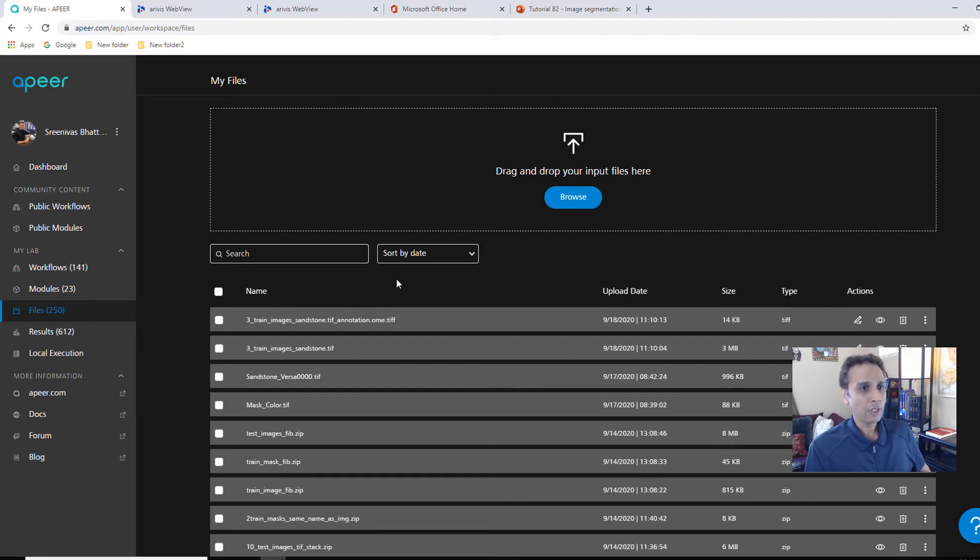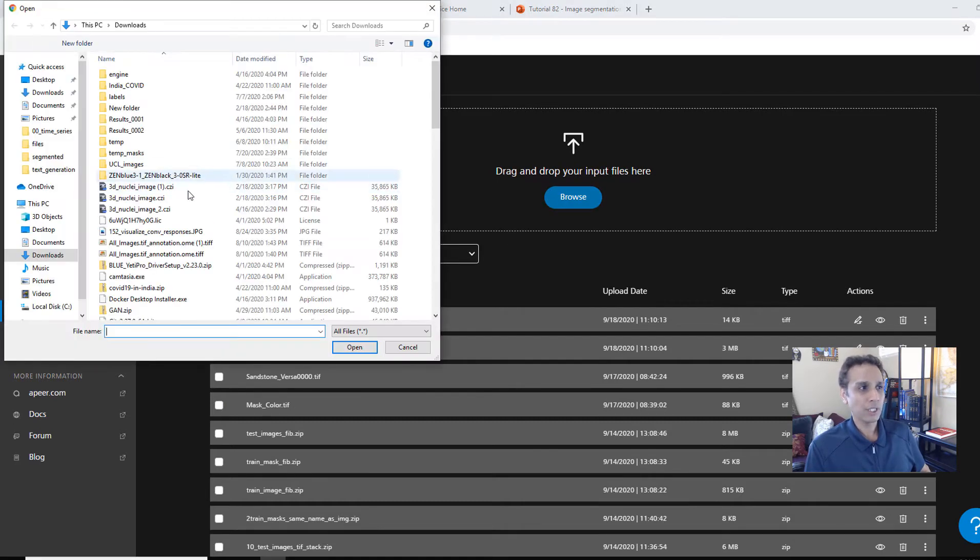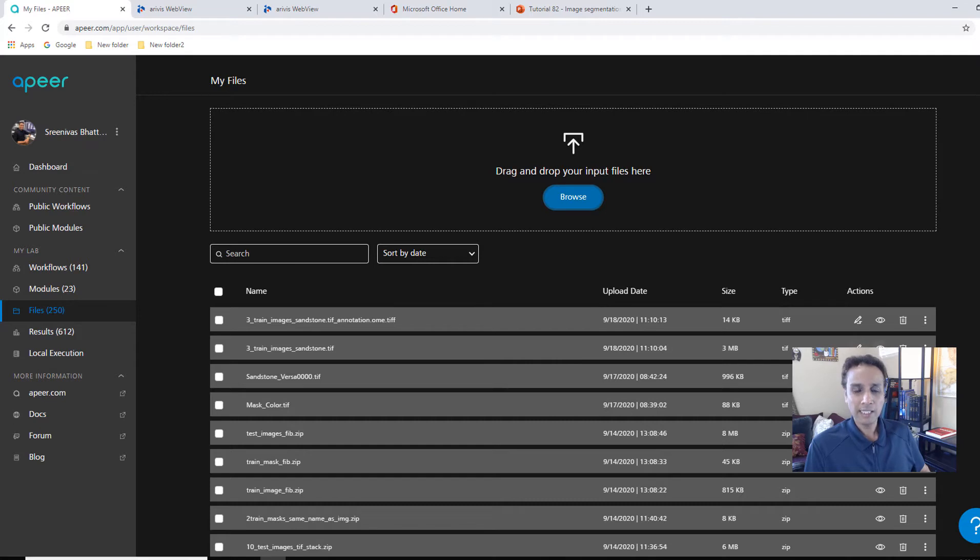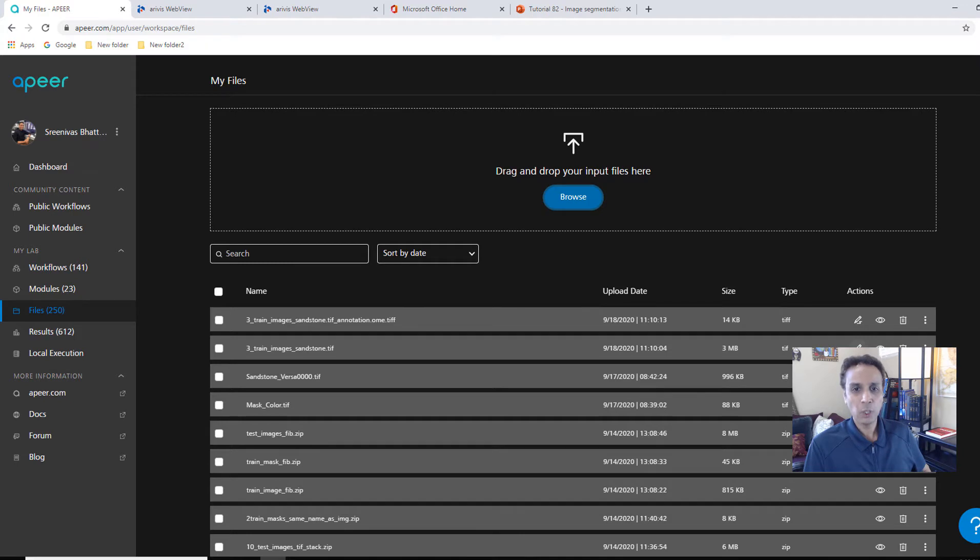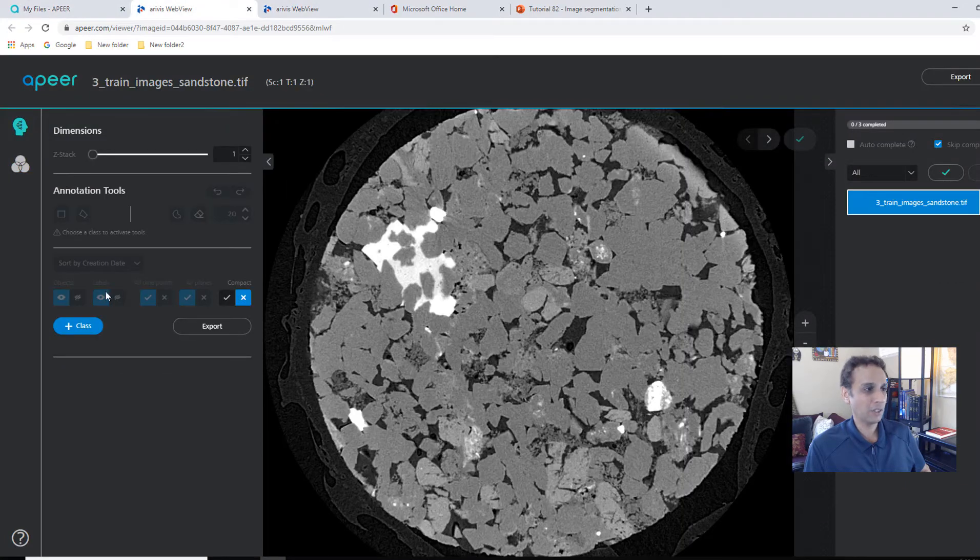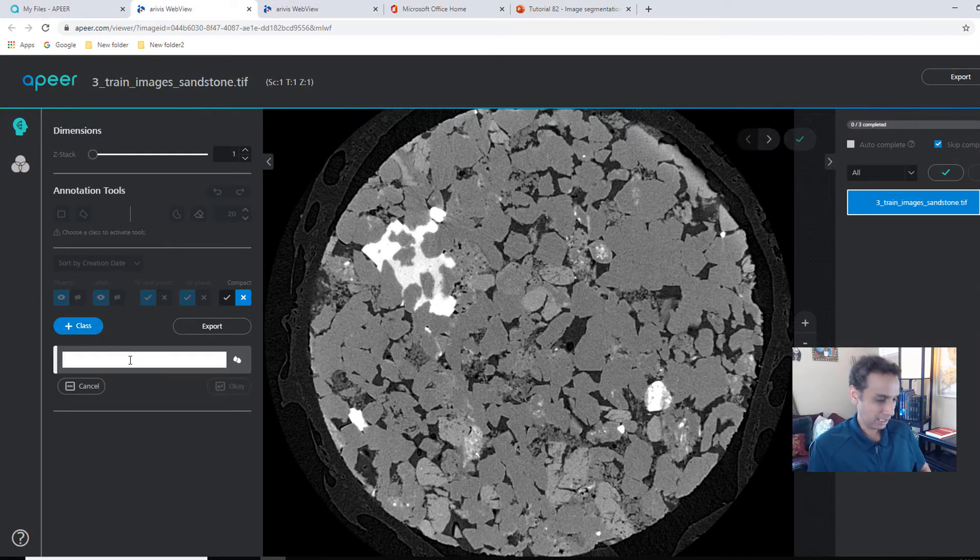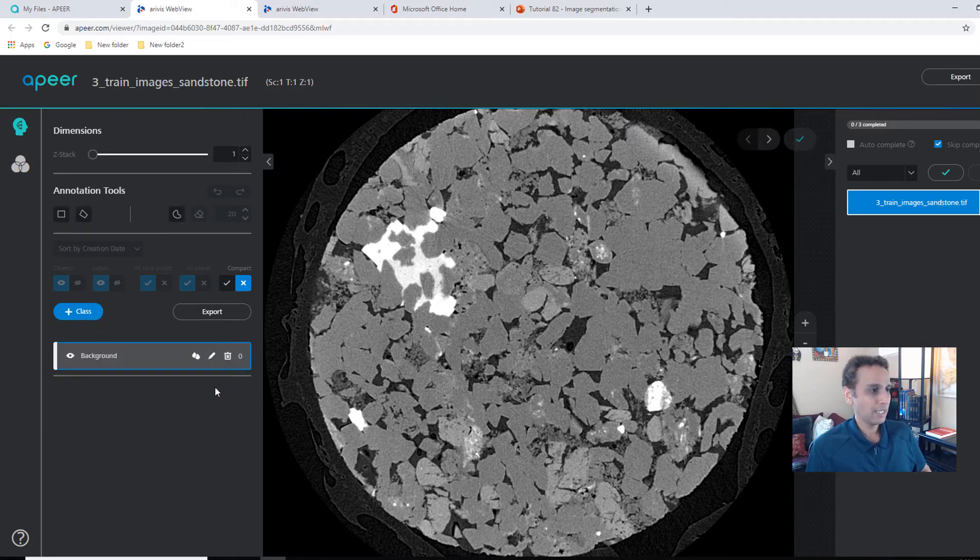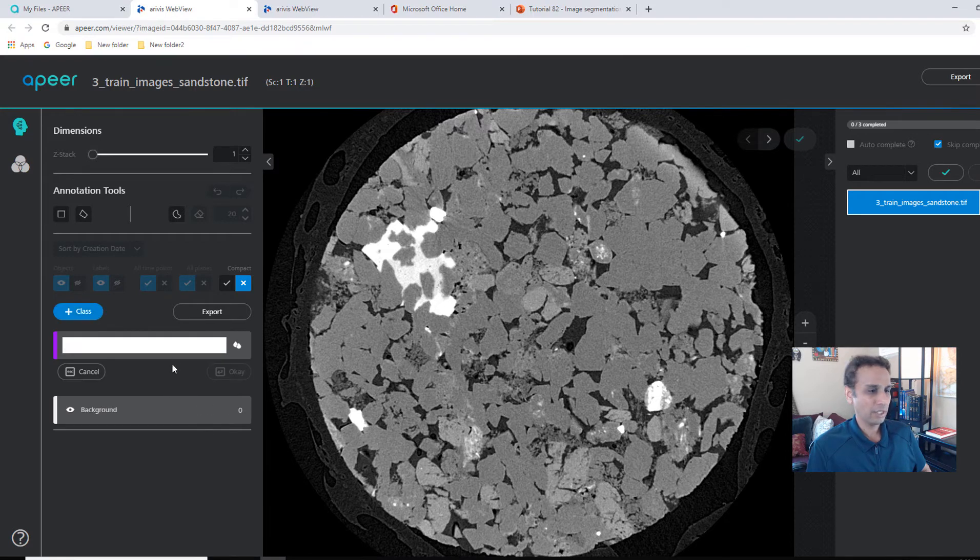So as you can see, these are the ones that were available as part of my workflow earlier. So I uploaded them beforehand. You can upload them from Zen if you want, if you have a Zen system or Zen software. And you can initiate these workflows from Zen if you want. So how do you load? All you got to do is go ahead, browse and then upload the files, or you can just go ahead and drag the files here.